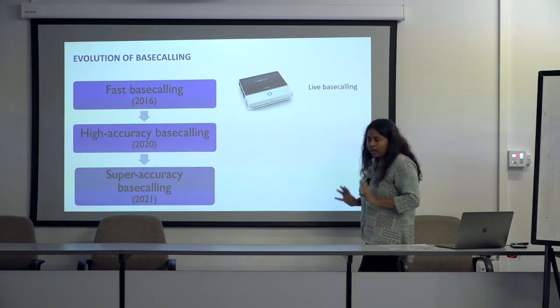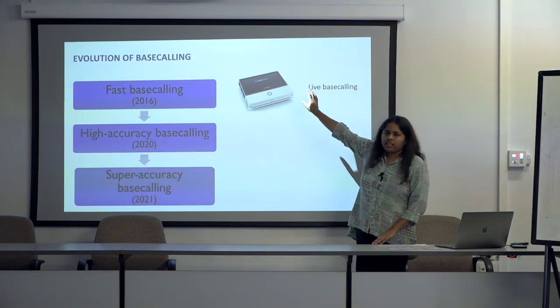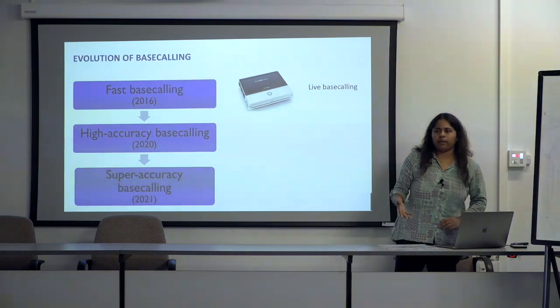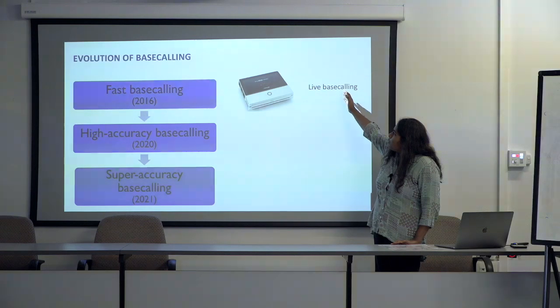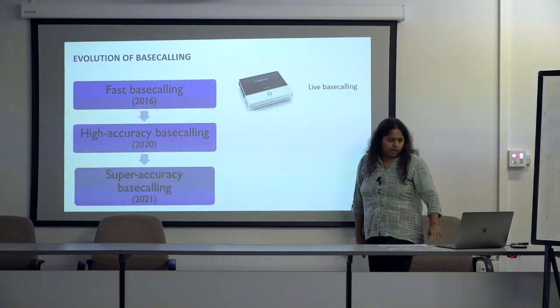So with fast base calling, the good thing is their device, the MK1C, can handle it, and it can do the base calling as the sequencing is going on. You can set it up in MinKNOW itself. You just have to enable live base calling, and MinKNOW will generate the fast base calls.